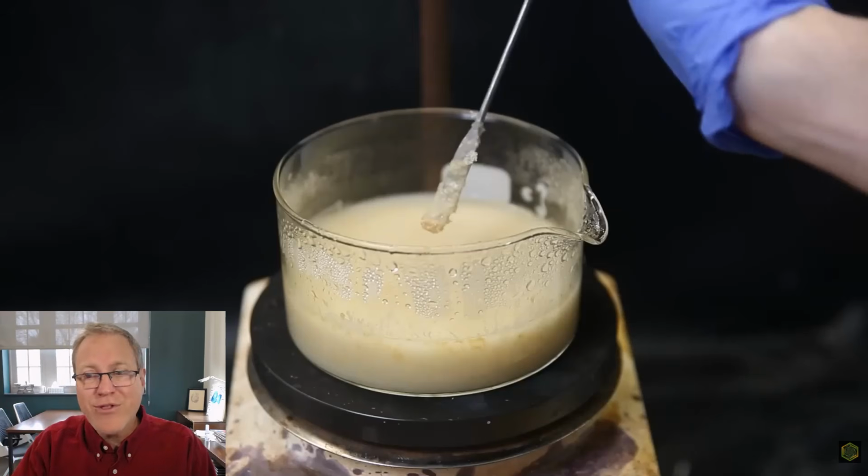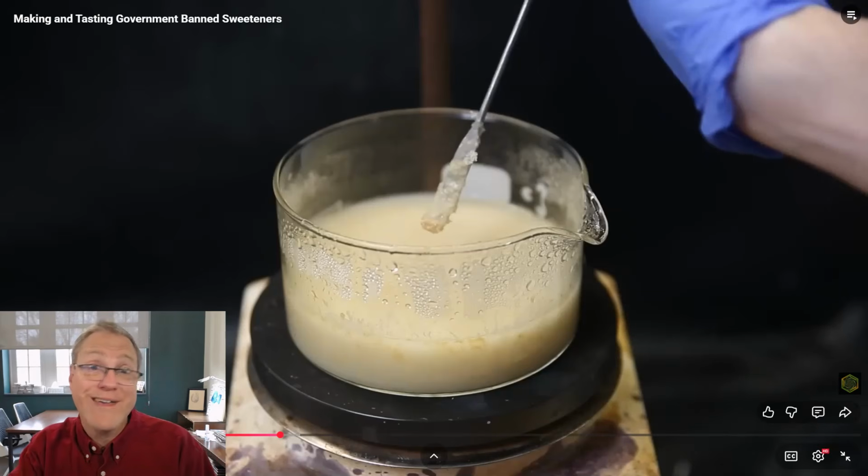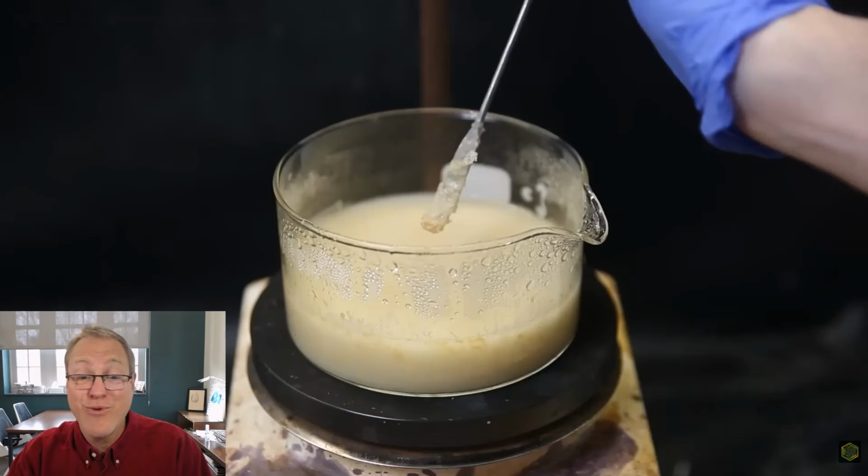You kind of like your solid to form slowly, but you're mostly happy you got solid. Let's not be too picky. He wanted solid, he got solid. Okay, that's a victory. Let's move forward.